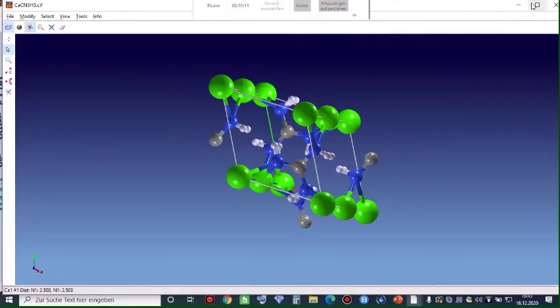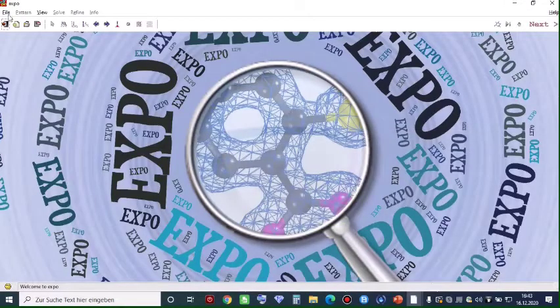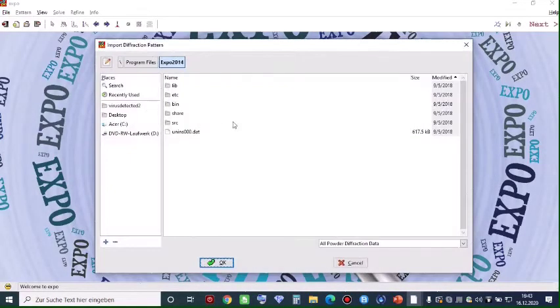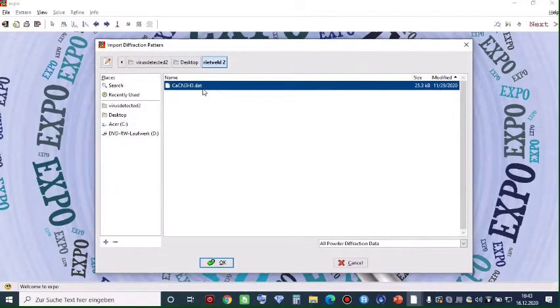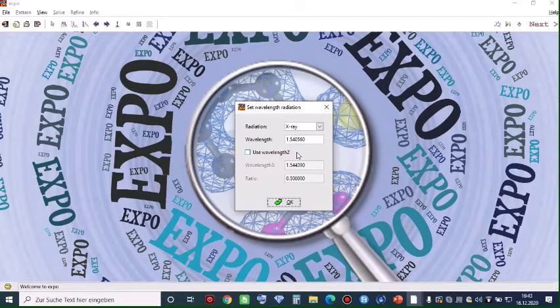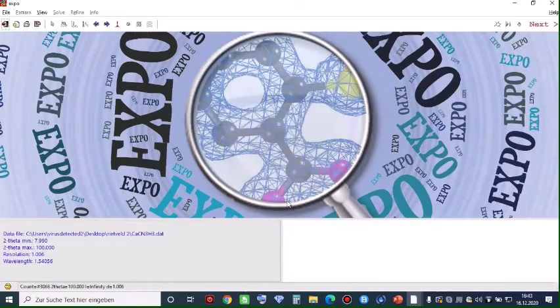Moving on, we minimize this window and we have to upload the diffraction pattern. In this case, it has been converted from raw data into DAT data. The name of the file is dot DAT. Then you click OK. Because we measured the data using a single wavelength, we just click OK — we don't click on this option. We just leave it alone and click OK.